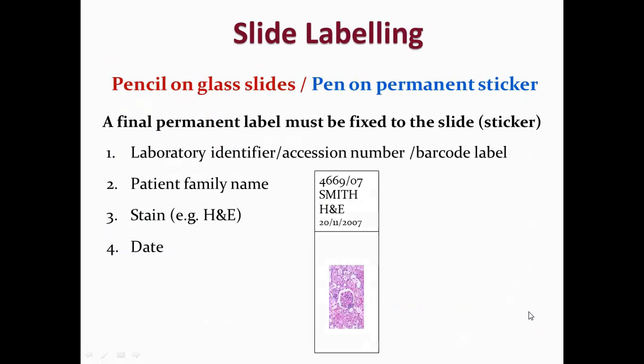Before we continue to talk about the method, first we must mention labelling of slides. This is to ensure traceability of samples and that the right result goes to the right patient. Don't forget when labelling glass slides to use pencil, and when finally your slides are finished, you can use a sticker and place it onto the label over the top of the pencil writing.